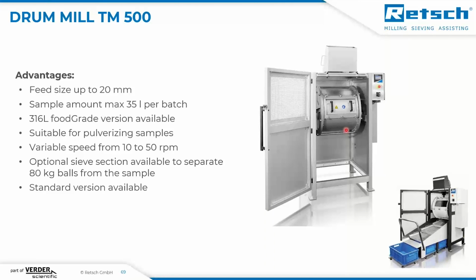And yeah, it's a ball mill again. Here we grind up the sample with balls, which is required for fine grinding. We have a very large drum, 150 liters, and it allows us to put in 35 liters per batch of sample with a maximum feed size of 20 millimeter.